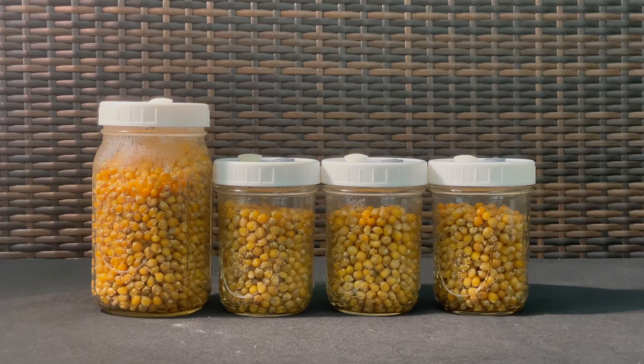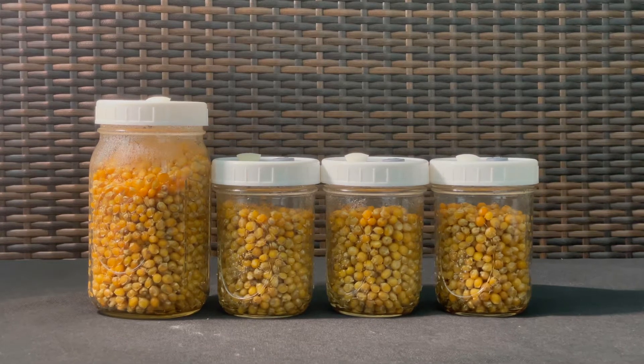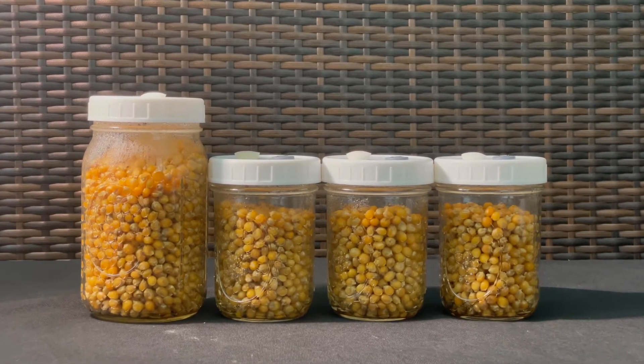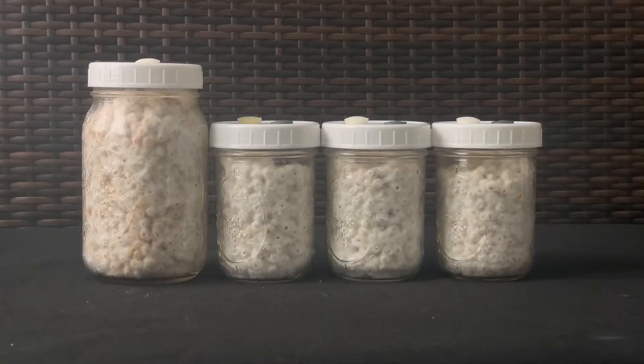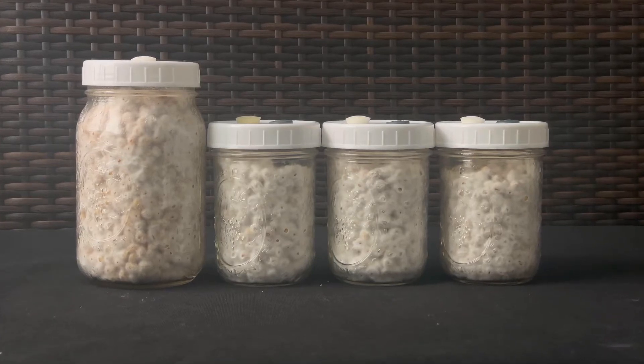In this video, we'll talk about how to sterilize your mushroom grain spawn jars, so you can go from this to this beautiful white mycelium growing in your jars.